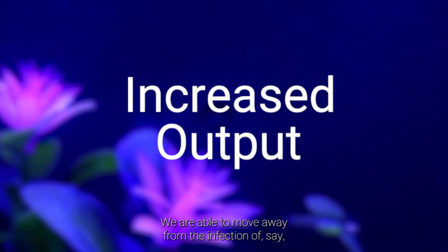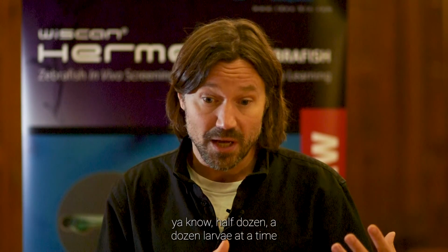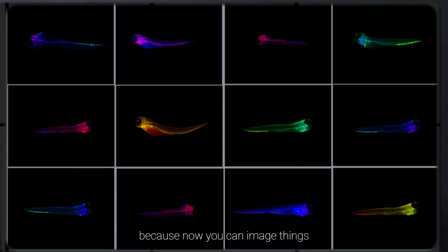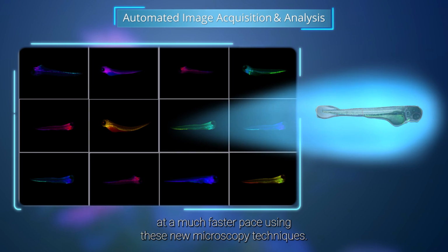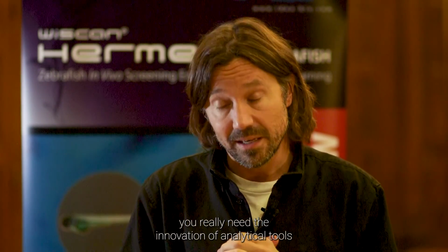We're able to move away from the infection of, say, half a dozen, a dozen larvae at a time, to now we're starting to work with 96 well plates, because now you can image things at a much faster pace using these new microscopy techniques. However, with these different microscopes, you really need the innovation of analytical tools.